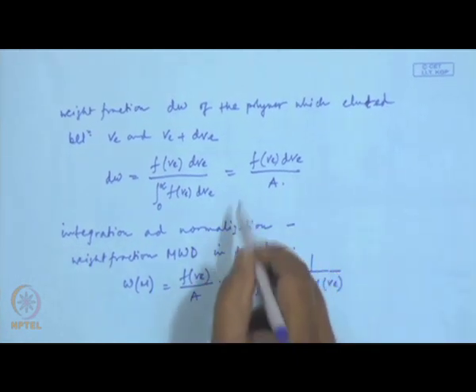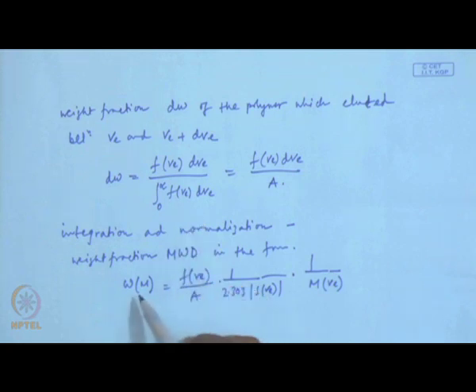So, mathematically we can do this and show that this weight fraction distribution can be expressed by this formula, where this is the detector signal at V, and this is the molecular weight which we got from the calibration curve for this particular V, and S(V) is the magnitude of the slope for this log M versus elution volume plot for that particular point V.